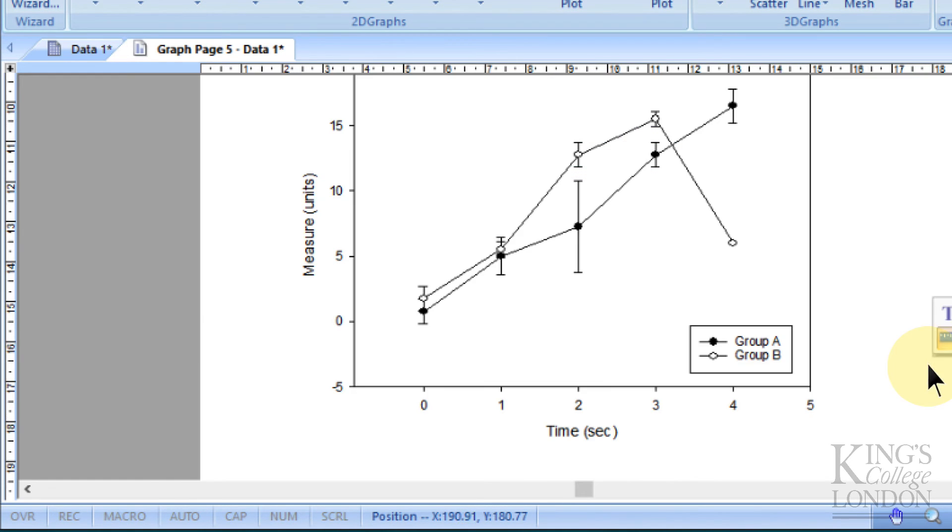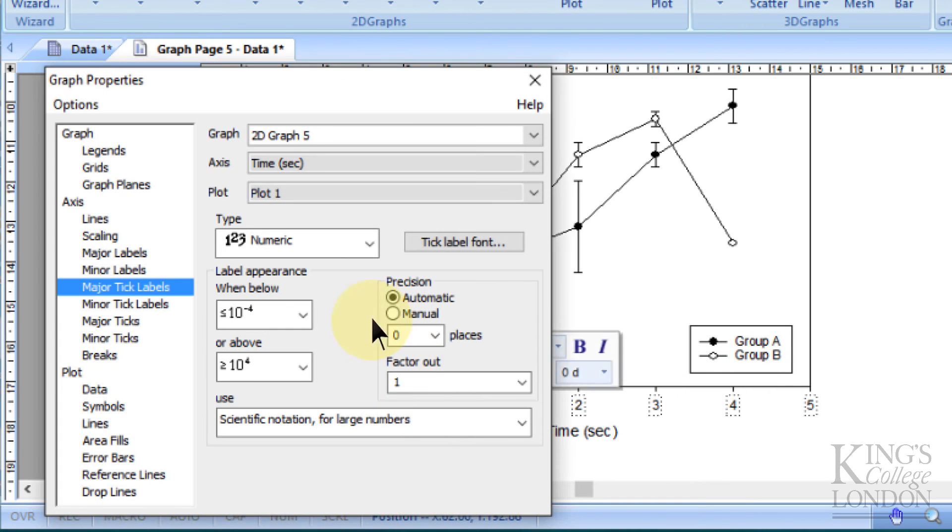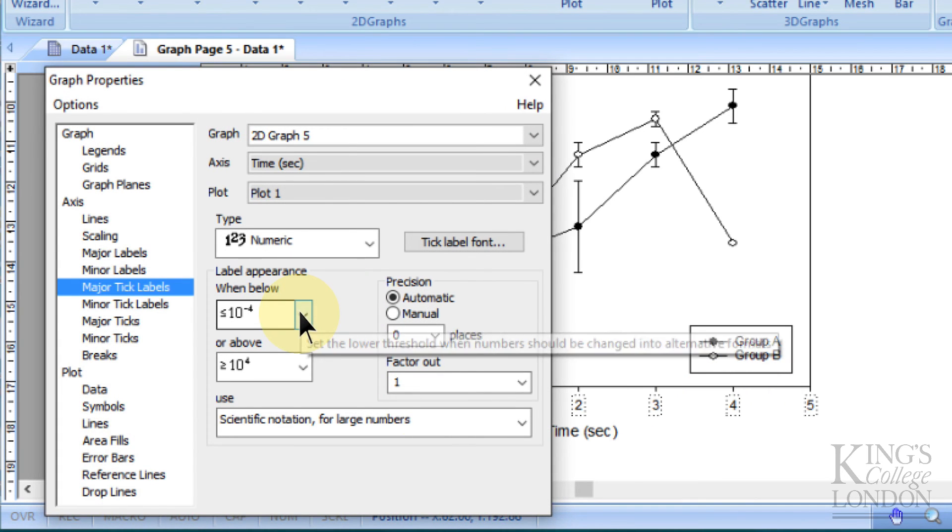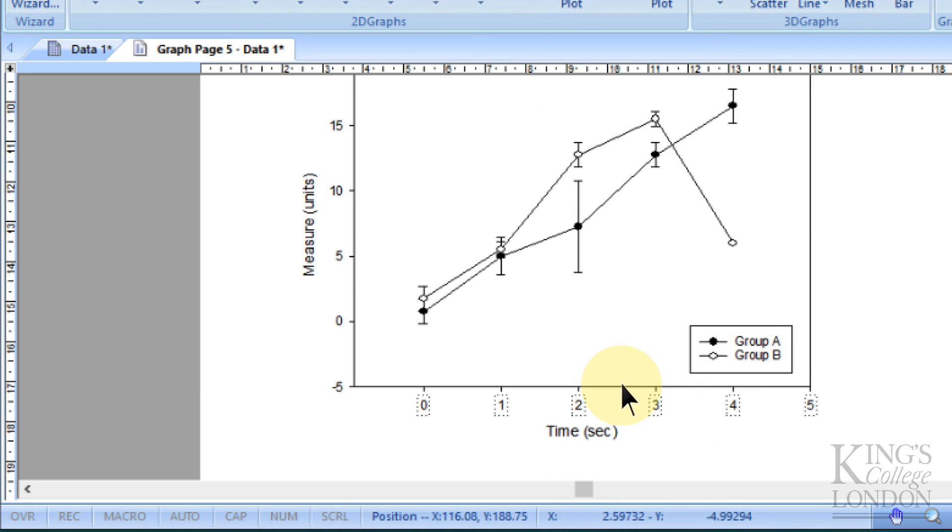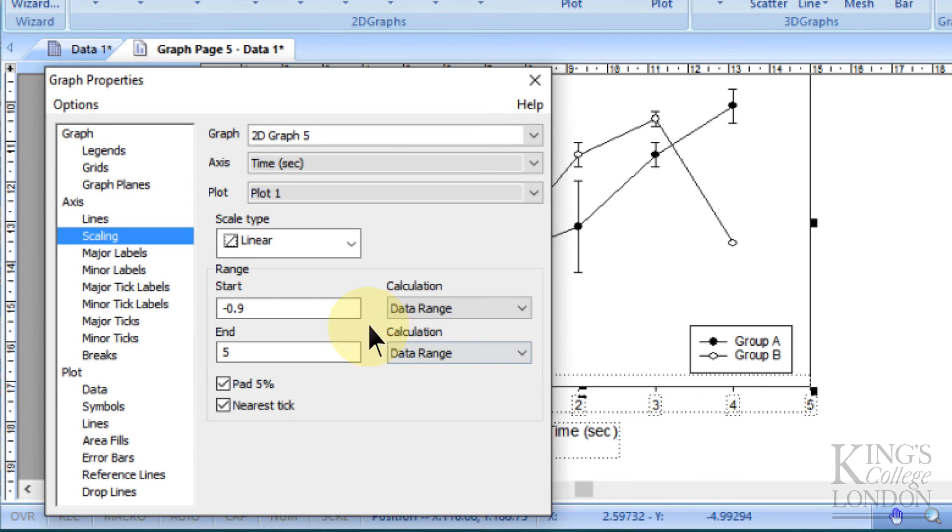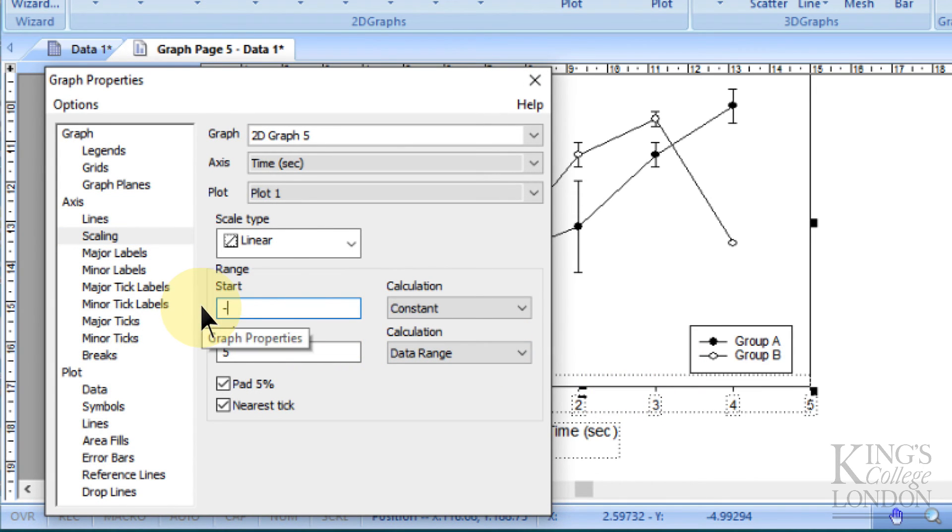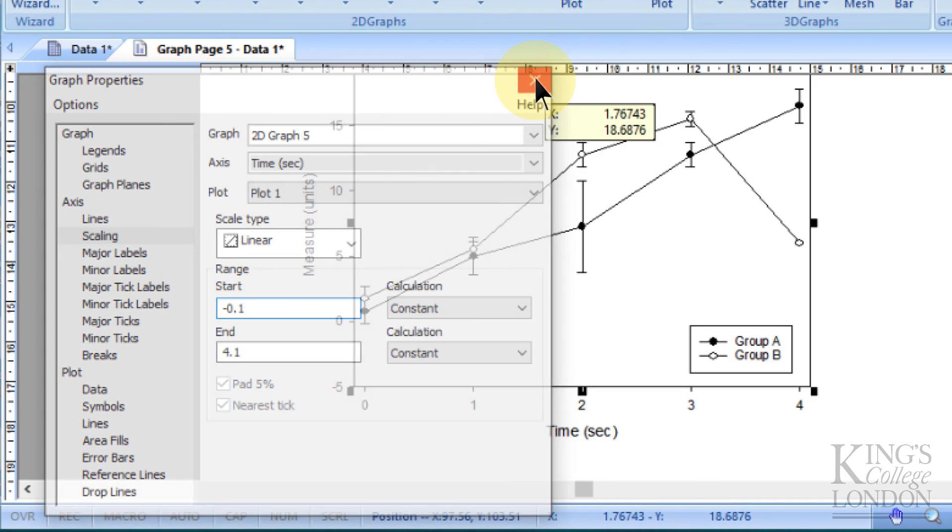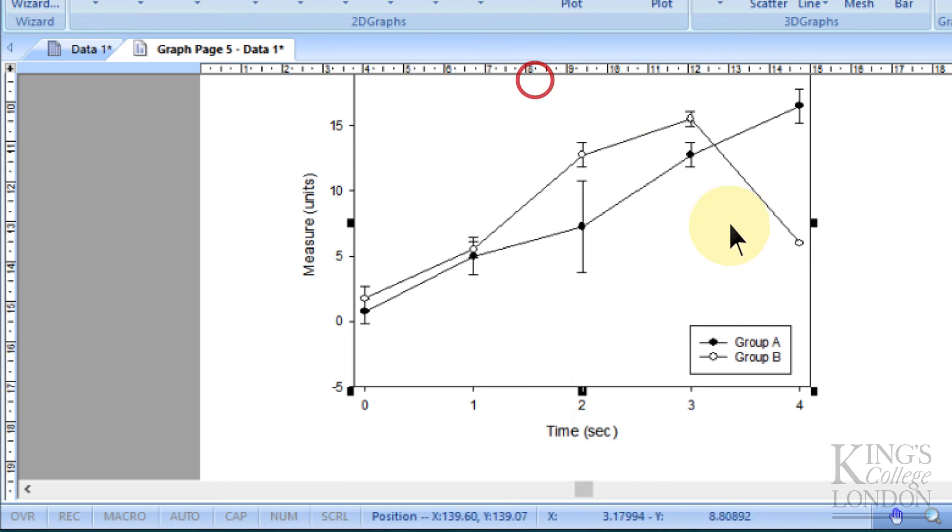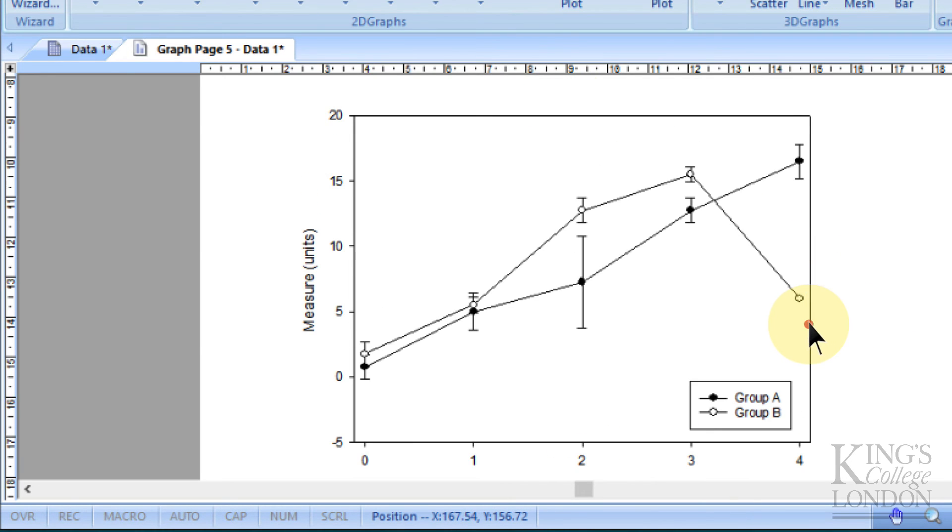And if we want to, we can re-scale the axis to fit our data sets a little bit better. So for instance, I'm going to double-click on the axis here and change it to go from minus 0.1 up to 4.1, and I'm going to hide the walls.